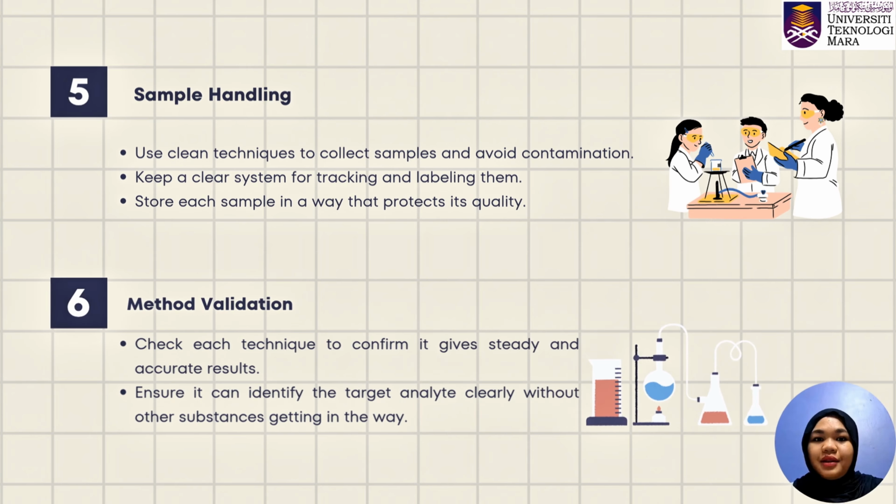Number 6. Method validation. Check each technique to confirm it gives steady and accurate results. Ensure it can identify the target analyte clearly without another substance getting in the way.